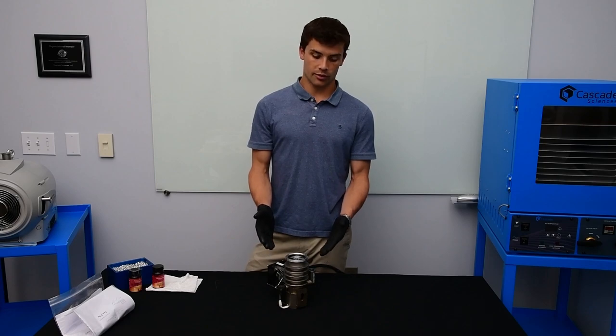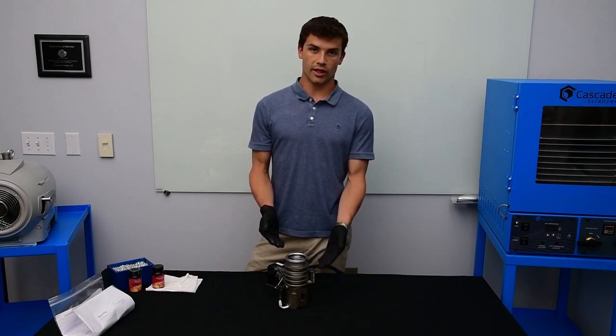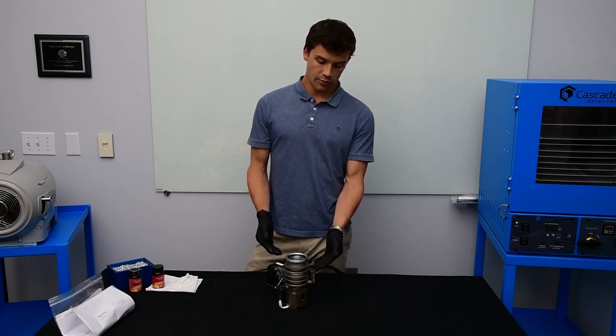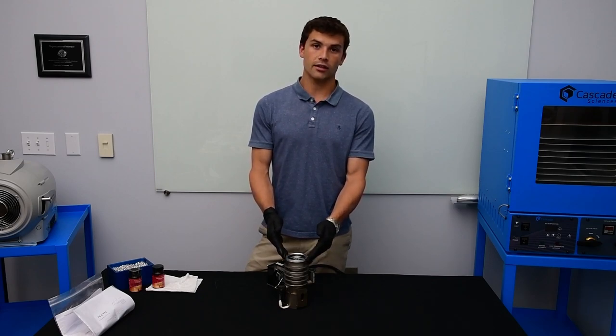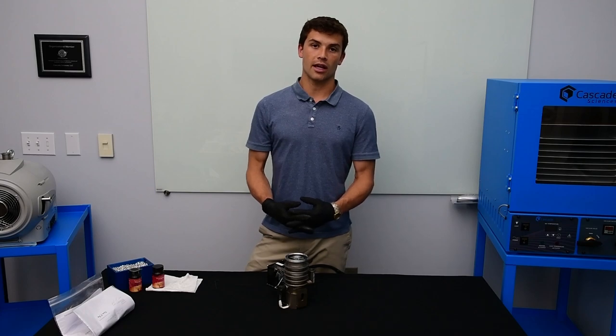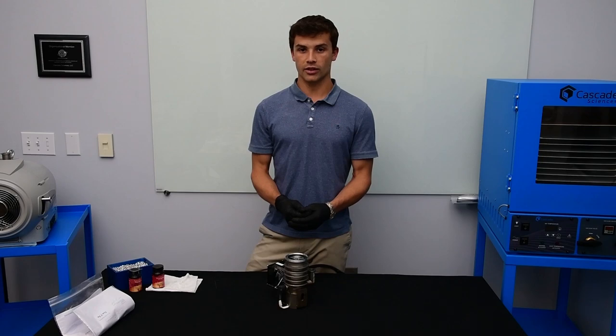Now let's talk about the pressures that you can operate this pump at. The foreline pressure that you need to have before you can start the pump is going to be 500 millitorr. For the inlet, the maximum pressure in a pure path or distillation application is going to be 100 millitorr.